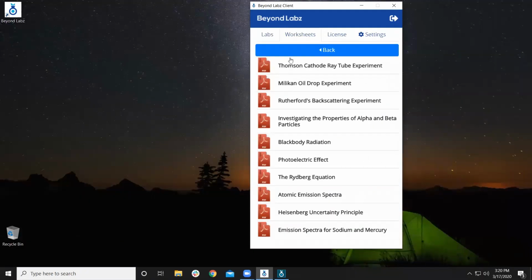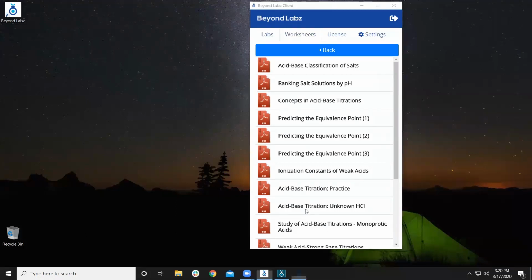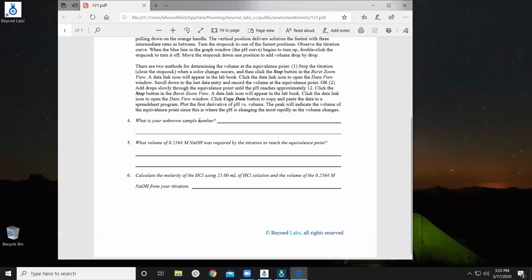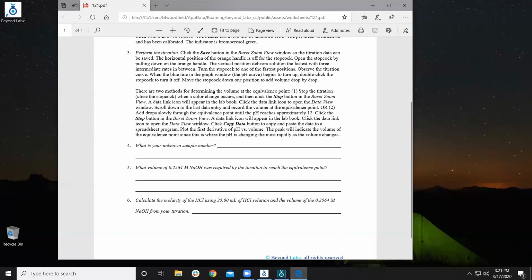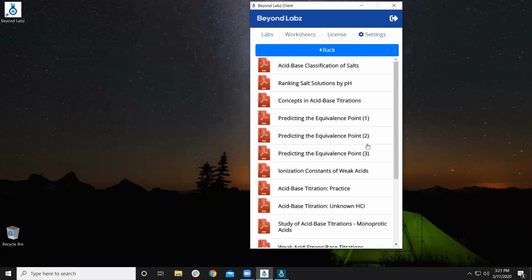So if you go to these worksheets, for example, and go back here to acid base, here's an acid base titration. This is just a worksheet where they could go fill out their data. So in this unknown, they would just report what their concentration is in this unknown, and give this as a piece of paper. And we would give you the solution keys to all of these worksheets, and you could just grade these by hand. So this is a really easy way. Here's a worksheet. Hand it in either on a piece of paper, which isn't going to work right now, or they take pictures, create a PDF, upload it into your LMS. Or sometimes people just say, email me the answers or give me a simple document in the LMS with the answers on it. That's one easy way of doing it.